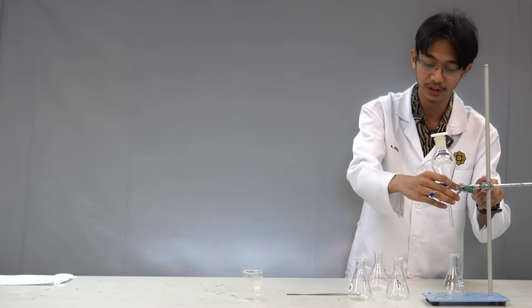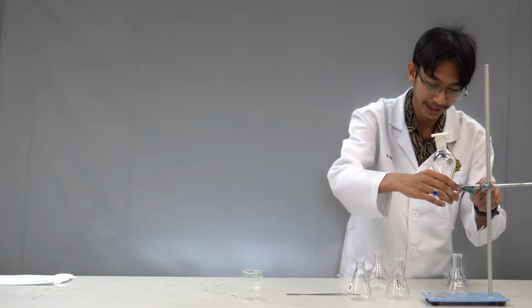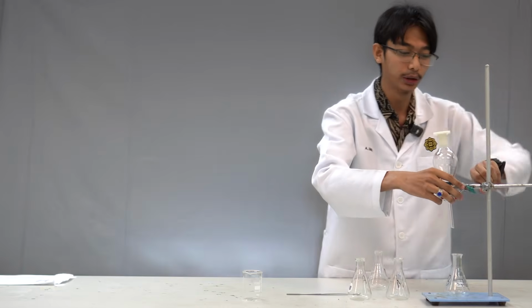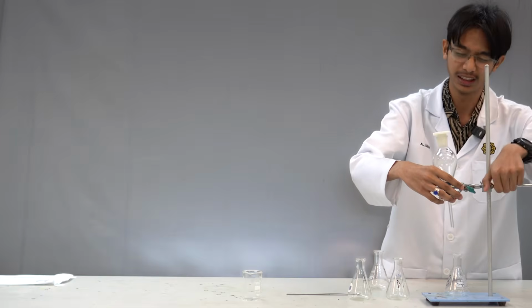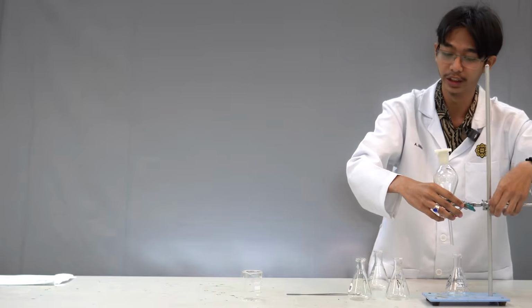So when you have the DCM mixture, you're going to take the mixture flask again. Similar to how you do titration, you have already done titration in the past, probably in CFS, probably in matriculation.